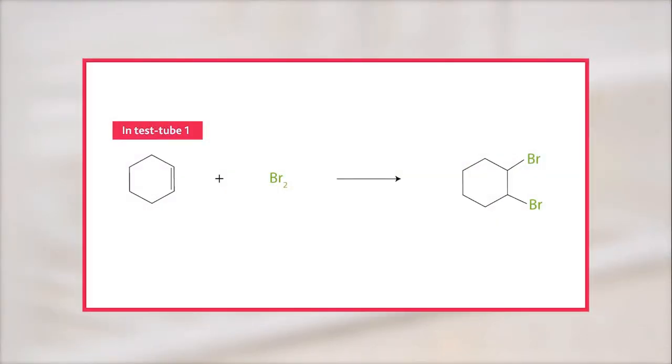The colourless addition product, 1,2-dibromo cyclohexane, is formed.